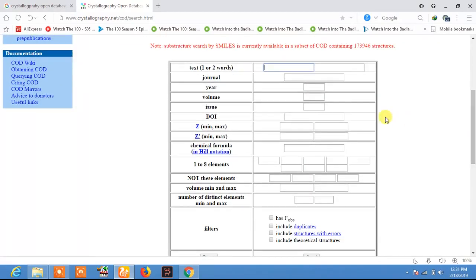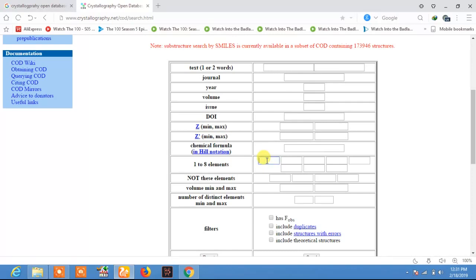The third method is searching by element. I will be searching for the TiC crystal structure by simply typing the elements present in the crystal. The elements present in the TiC crystal structure are titanium and carbon, so type Ti and then carbon.